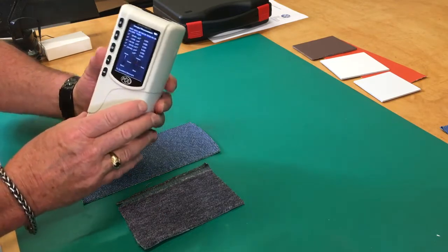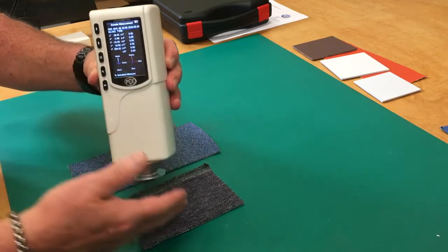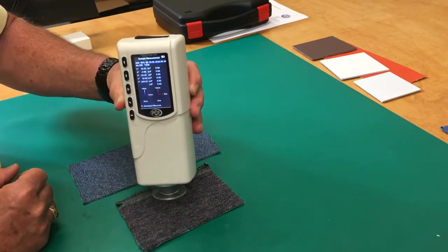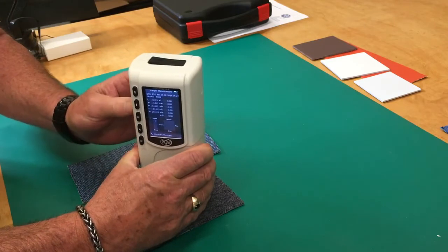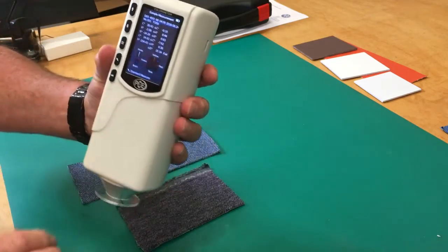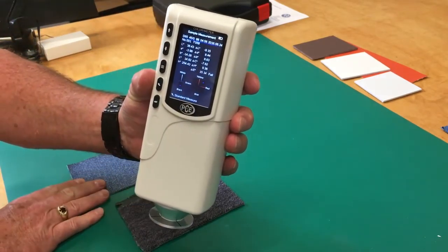And then we check it against this color that just came in. Hit enter. We notice that on the right hand side, our standard colors are here. We're going to compare them against the left hand side with our new color fabric that just came in. We notice that it failed — this is not the same color as what we've been using.